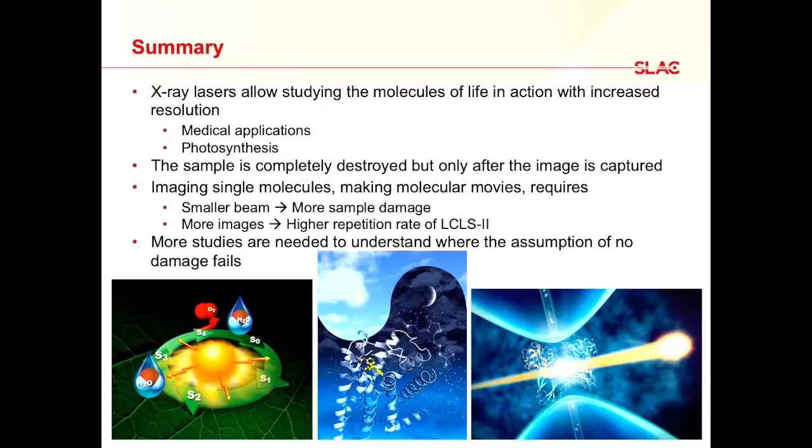As a quick summary, I hope I have shown you that X-ray lasers allow studying molecules of life in action with improved resolution compared to more conventional X-ray sources. It has medical applications and understanding photosynthesis, among many others.